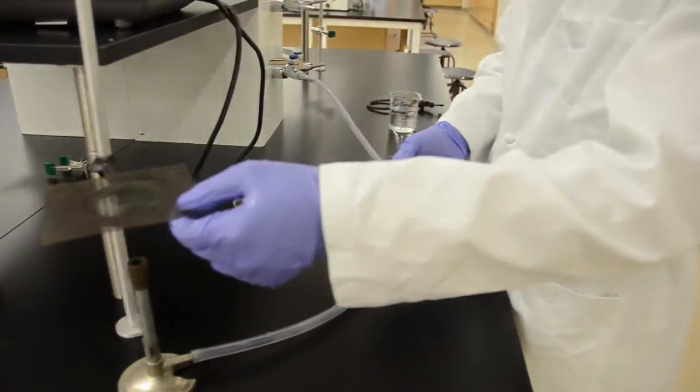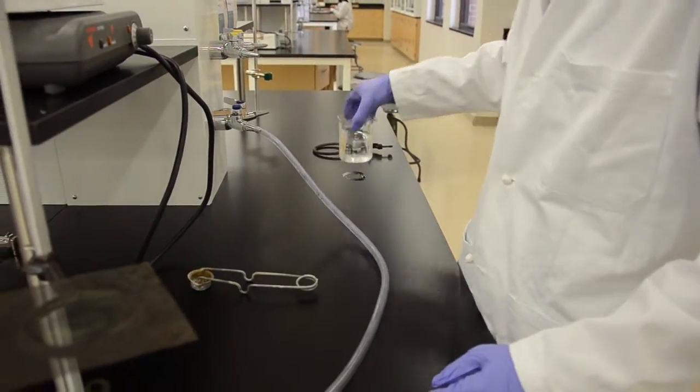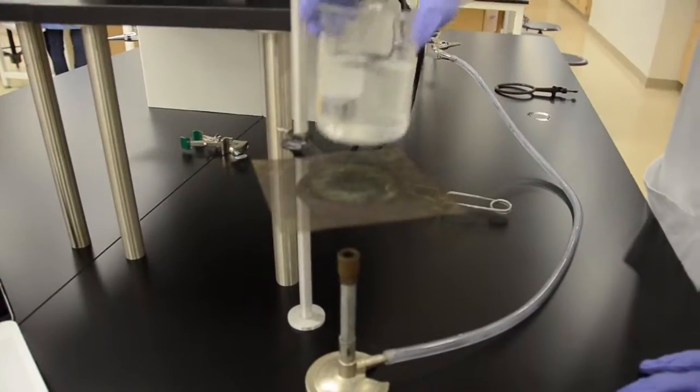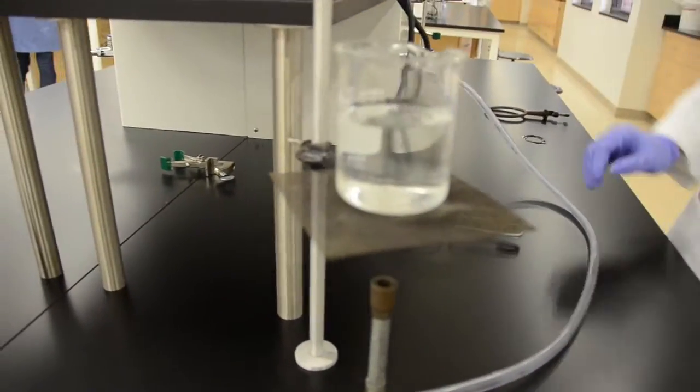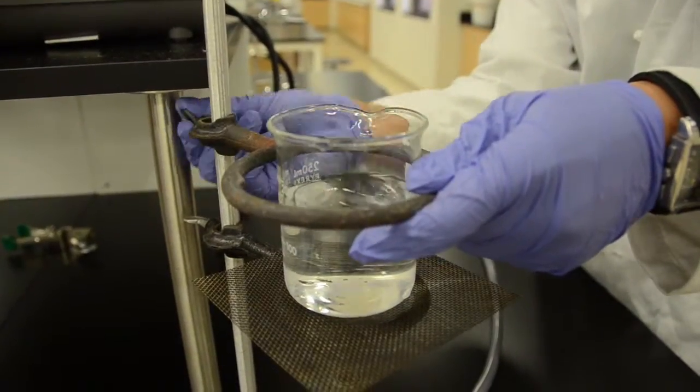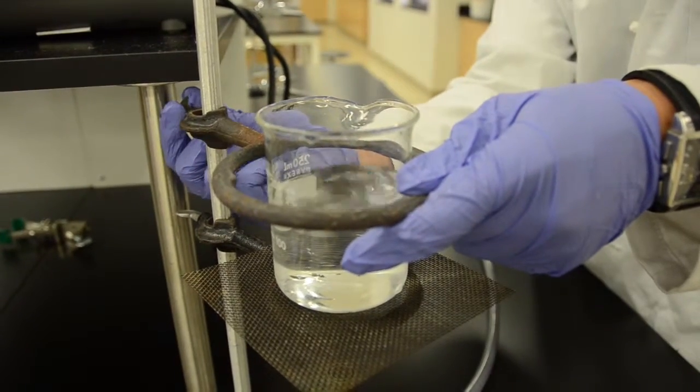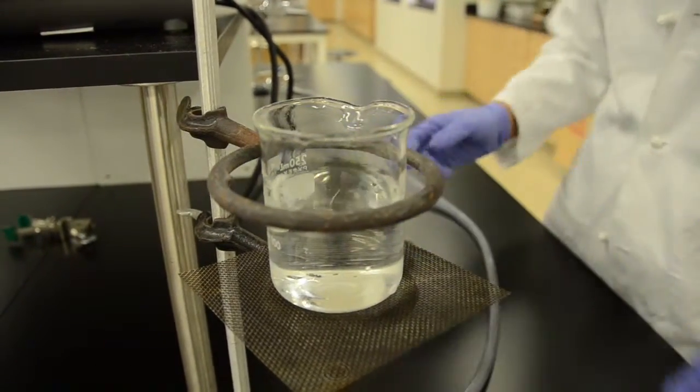Next, place the wire mesh screen atop the ring clamp and then the 250 milliliter beaker, filled with whatever liquid you wish to heat, in this case water, on the mesh screen. The last thing we do before igniting the Bunsen burner is place the second ring clamp around the beaker so that it prevents the beaker from falling off of the wire mesh screen.